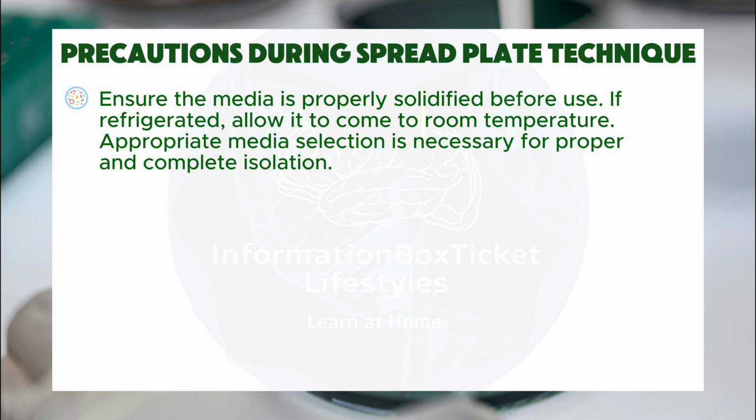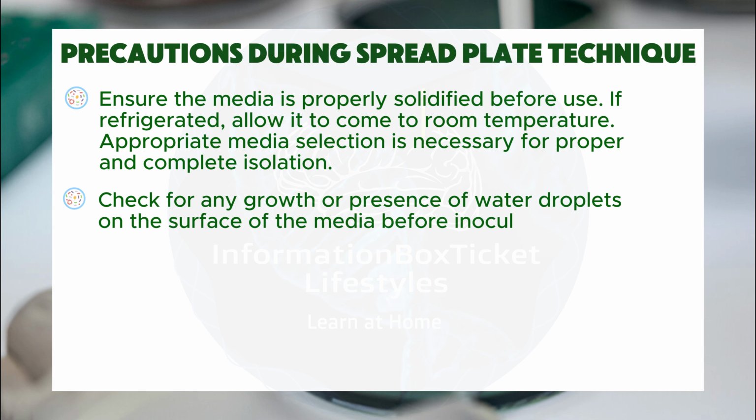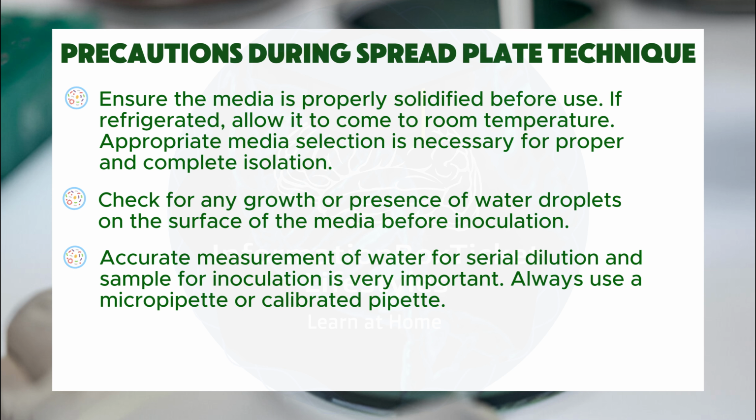Appropriate media selection is necessary for proper and complete isolation. Check for any growth or presence of water droplets on the surface of the media before inoculation. Accurate measurement of water for serial dilution and sample for inoculation is very important. Always use a micropipette or calibrated pipette.